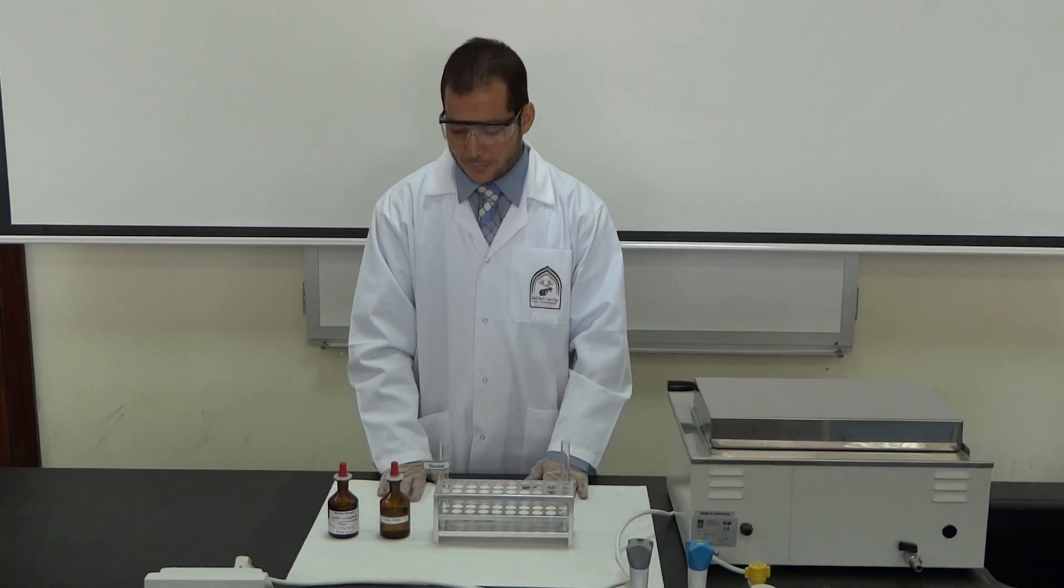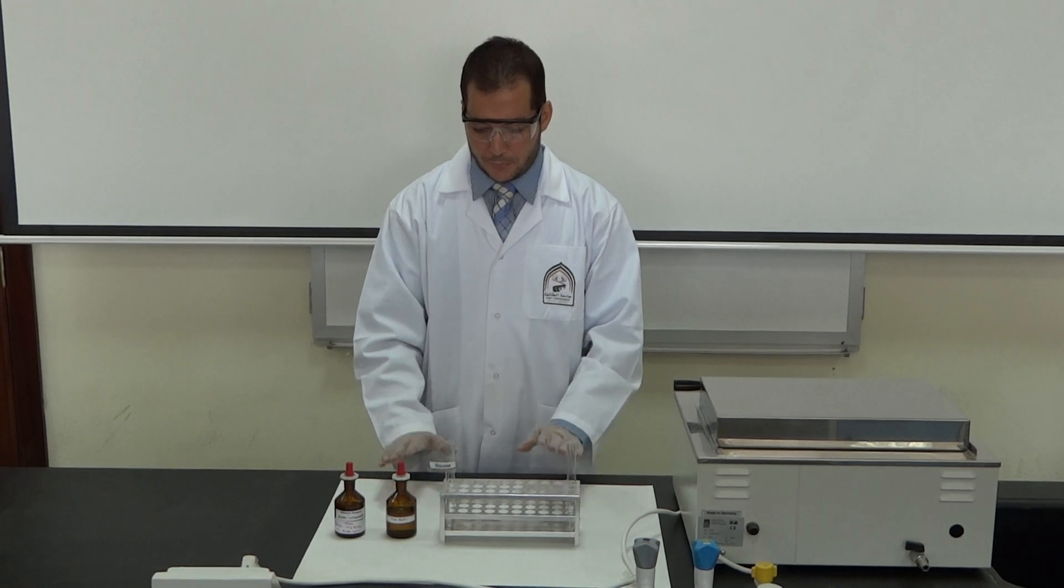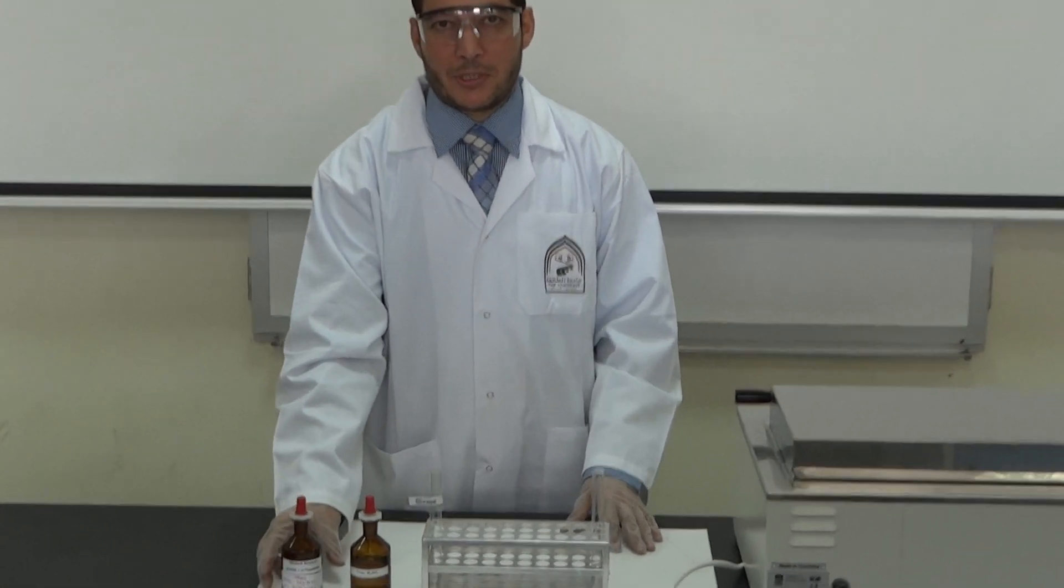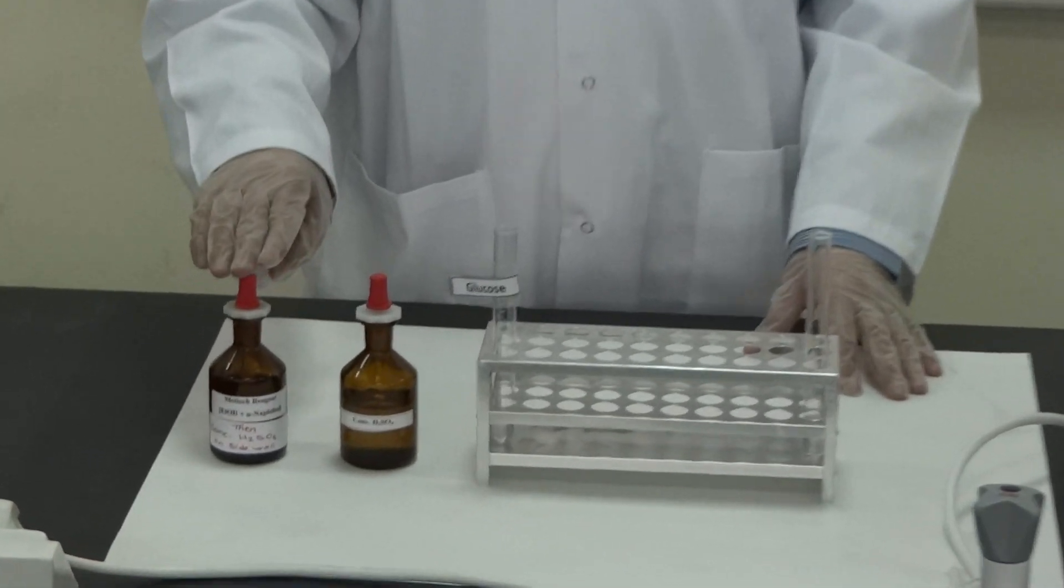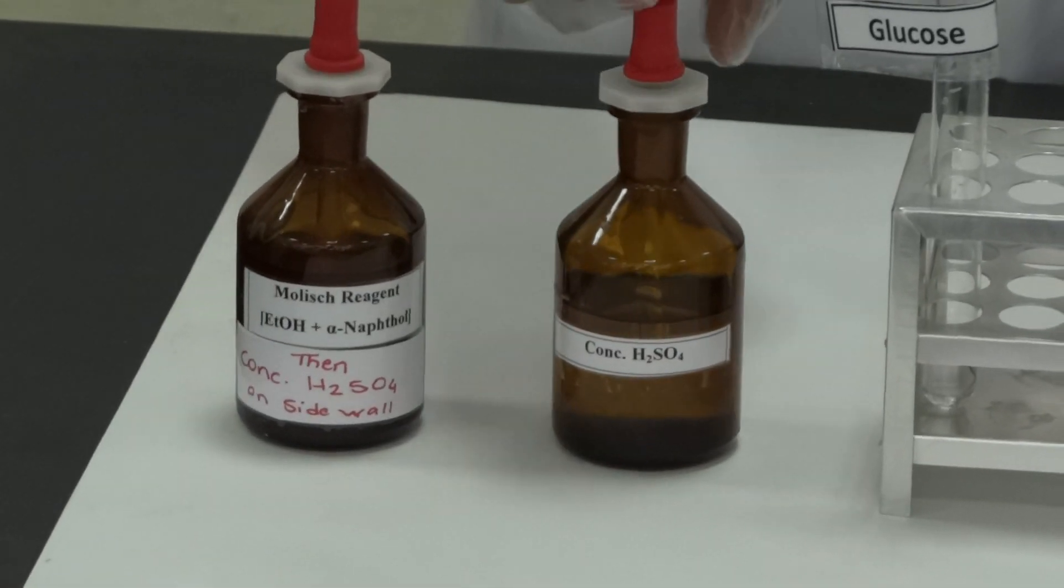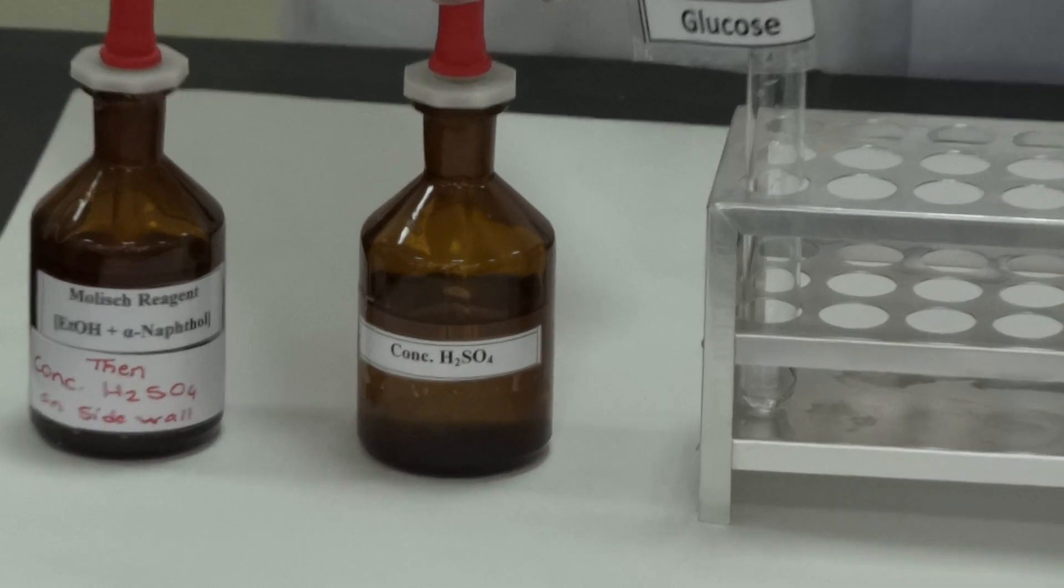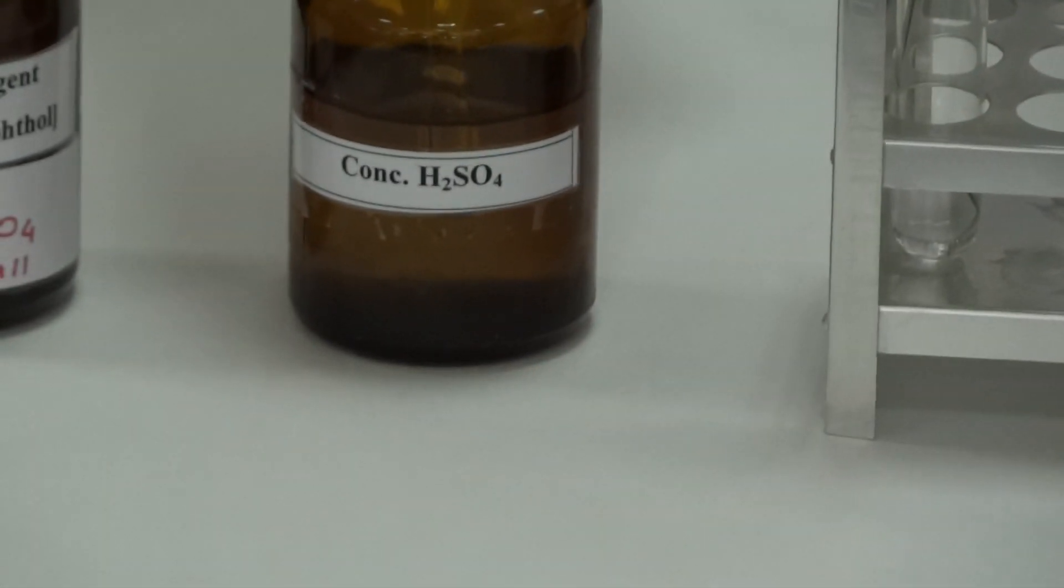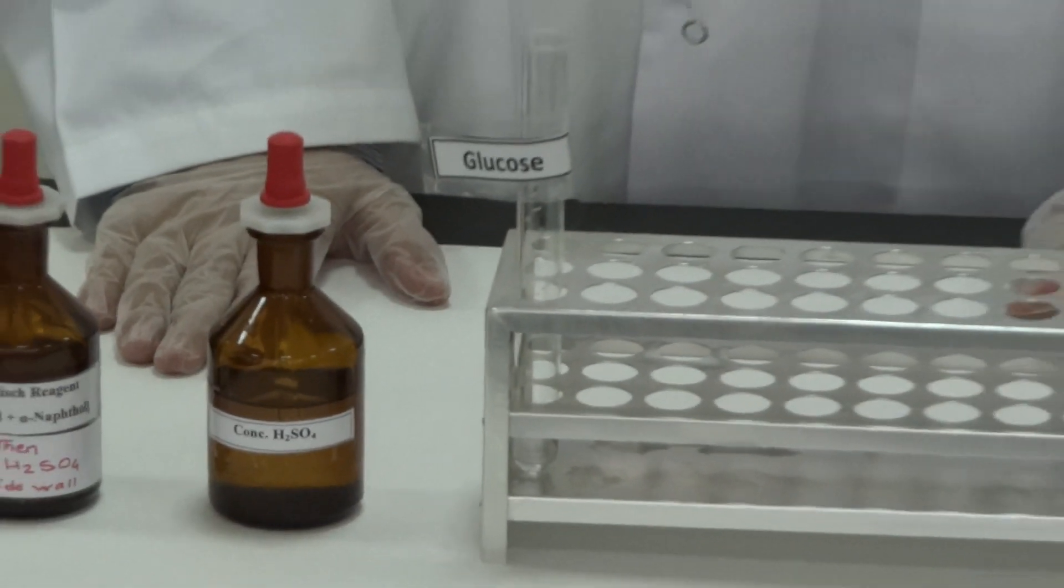So let's do a Molisch test. For starting a Molisch test, it should have a Molisch reagent, which is alpha-naphthol in ethanol. And here, concentrated sulfuric acid. So, what are we going to test?